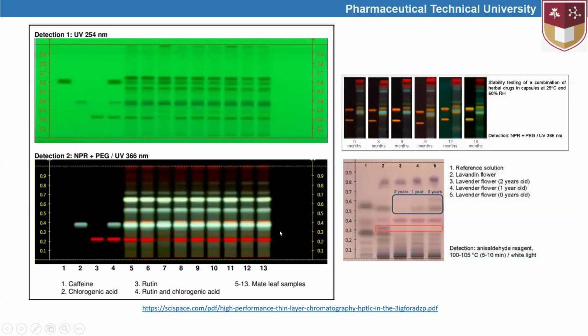I mean, the extract in the seventh position can be considered to differ from others in the composition of rutin. So by using faster approaches like this, it will be possible to know about the comparative efficacies of the samples or extracting methods by comparing those extracts with others.